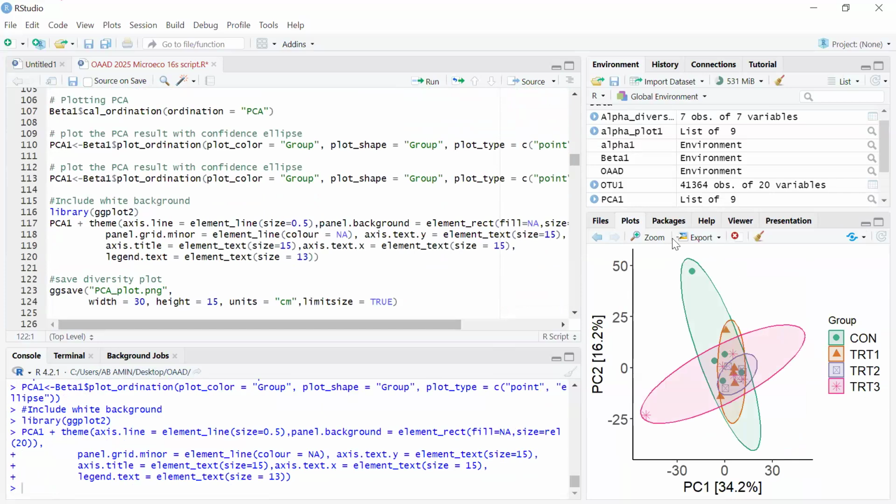So you can see the PCA of the same data set is completely different from the PCoA, in the organization of the ellipses. This one is calculated based on Euclidean distances, unlike the other one based on the Jaccard dissimilarity matrix or Bray-Curtis. However, ours was strictly based on Bray-Curtis.